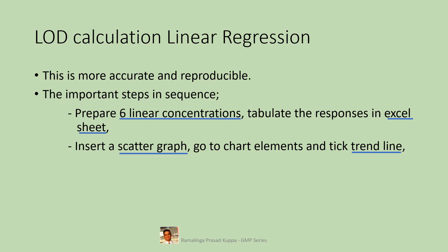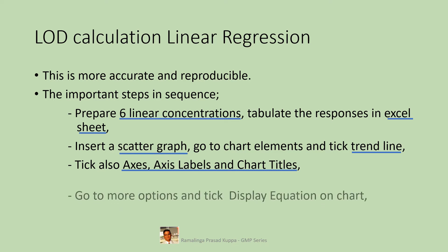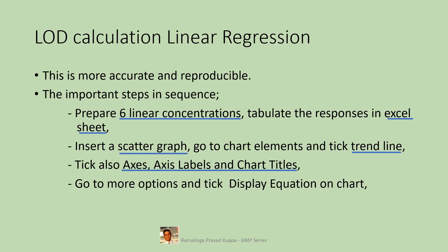Go to chart elements — some Excel versions have a separate tab for this, while others have a plus mark beside the graph. Select the linear option for simple linear regression, then tick the trend line. Select axis labels and chart titles so the graph has all data displayed. Go to More Options and click 'Display Equation on Chart.' You will see the data displayed on screen with slope and intercept — note the slope value.